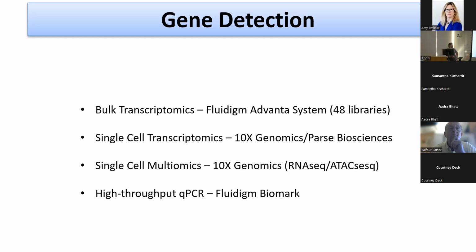The big difference between these two is the first one is a droplet-based technology, which you're all familiar with, that the chemistry is done in droplets. And this typically requires live cells. Most people use live cells for this, and that kind of limits a lot of people if you're off-site. If you have a tumor that came yesterday and you can't actually get it to us live or fresh, it really limits some of the samples that we can process.